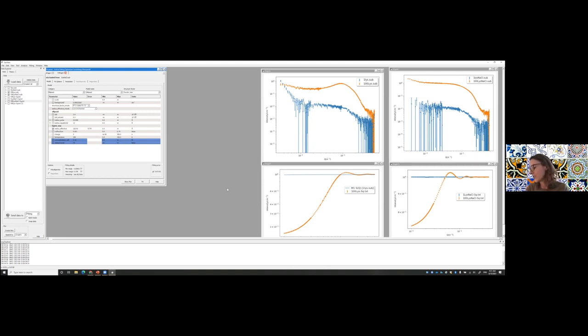There was a suggested point of discussion: if you fitted the volume fractions, so the scale in your parameters, why was it, for example, less than 0.1 for the 100 mg per mil? I don't know if that's the result that you obtained when you tried your fits. When I did my fits, I ended up having a scale that was less than 0.1, which is what I would expect for the 100 mg per mil.